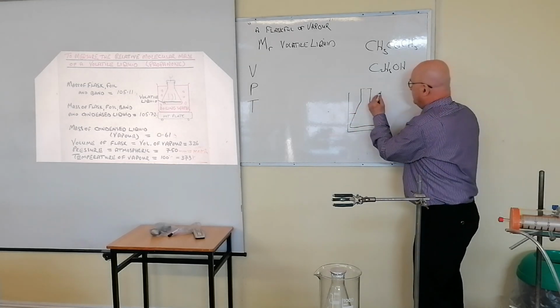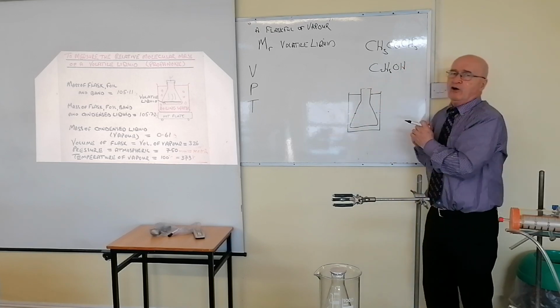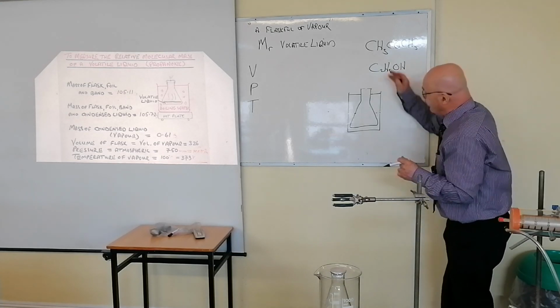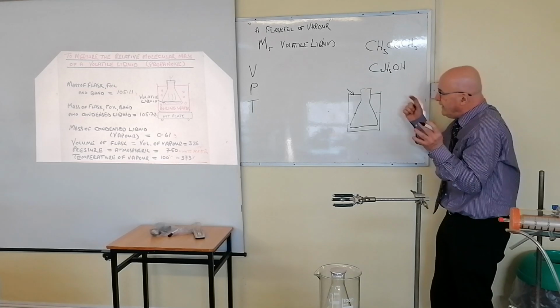It's very important. The level of the water is clearly at the top of the flask or near. It can't be submerged, obviously, because water will go through the pinhole. But it must be very high. That's one aspect of the detail that must be there. You label everything now, by the way.